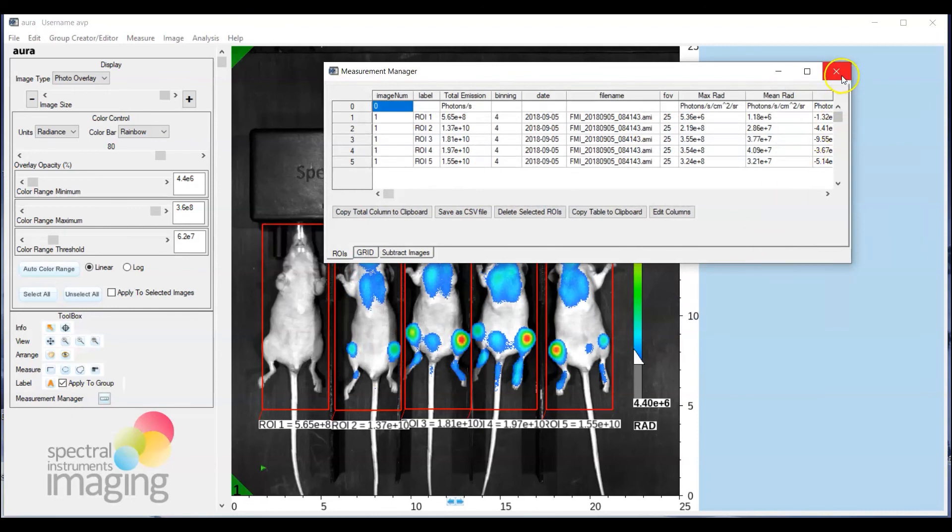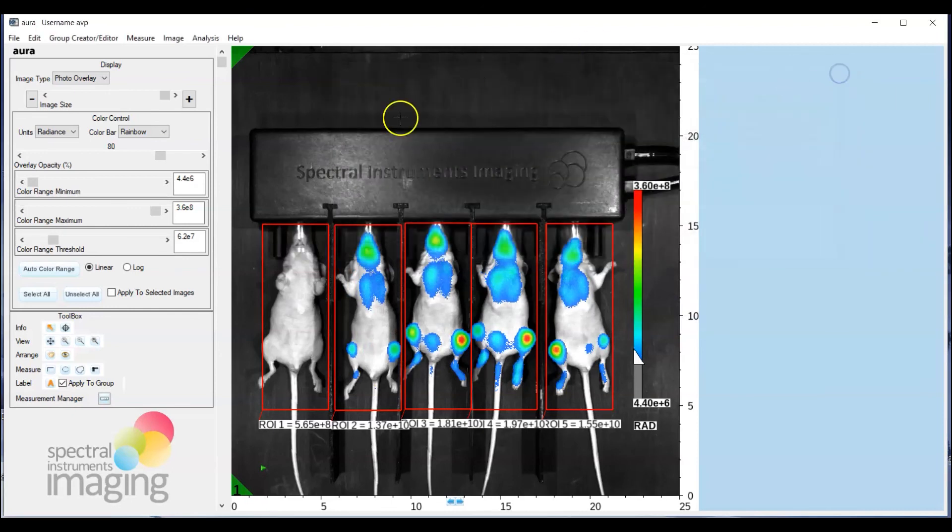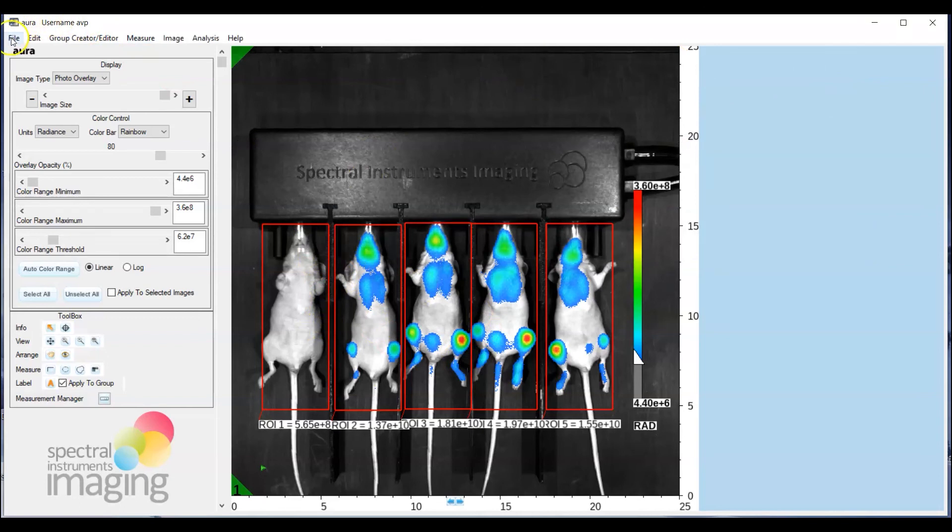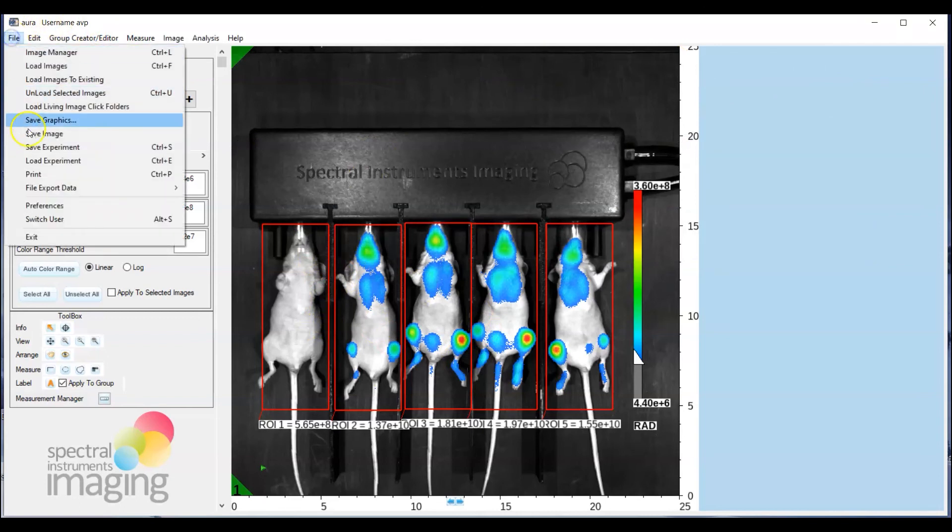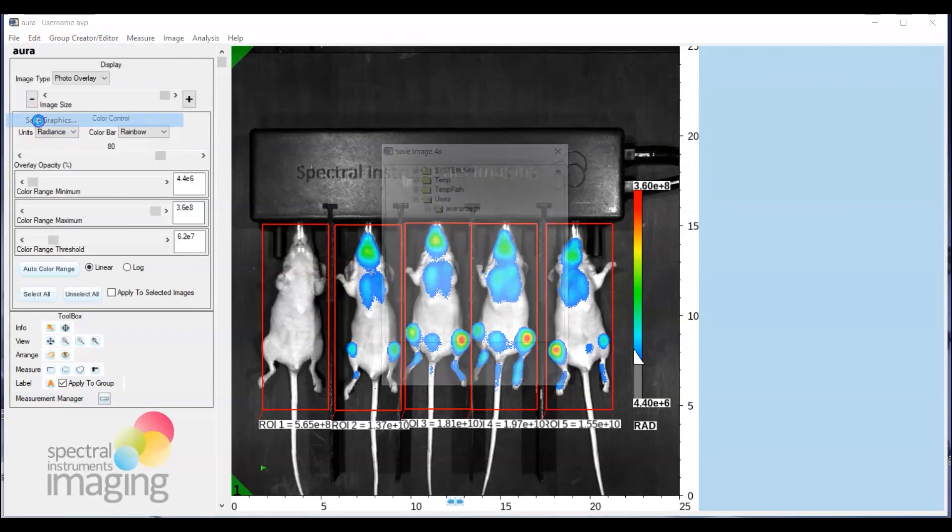All right now the image itself of course with your ROI analysis presentation can be saved by simply going to file and doing save graphics.